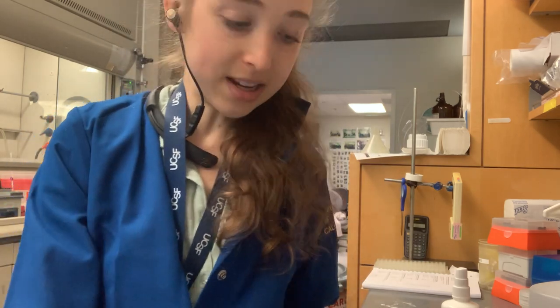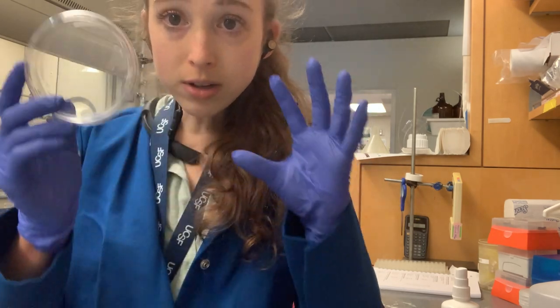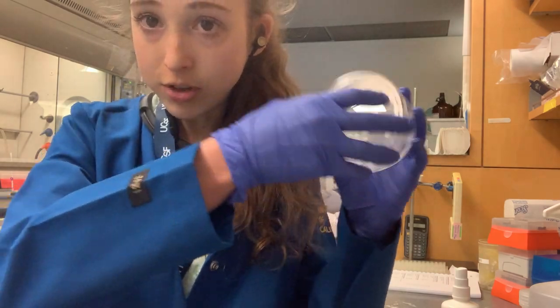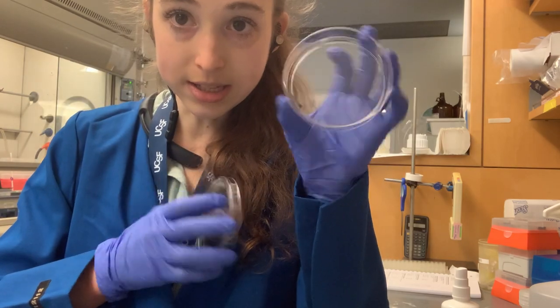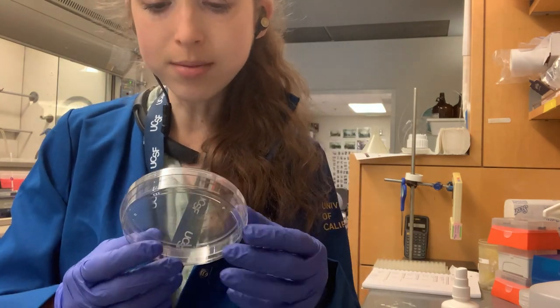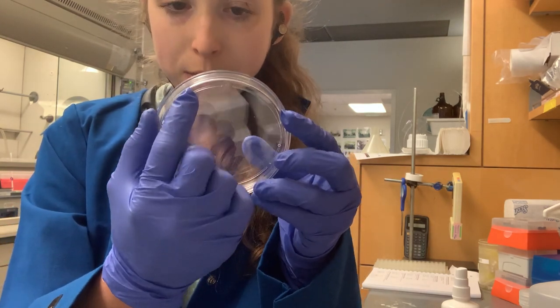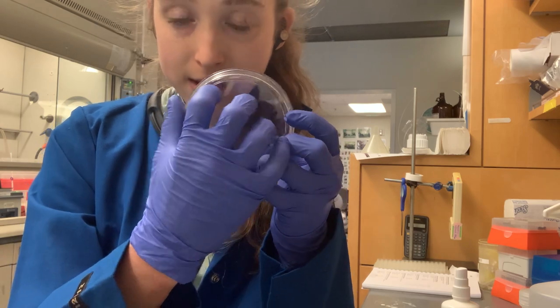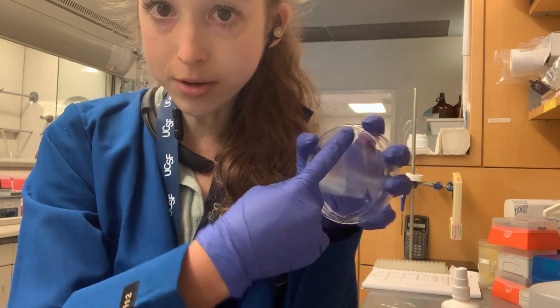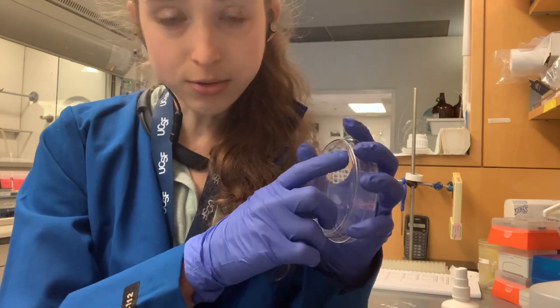Going back to the whole idea about labeling caps versus bottles — when you label a petri dish and take the lid off, which cell was this? With bacterial petri dishes, I like to write around the edge: the plasmid name, the cell type — DH5 alpha, BL21, that sort of thing.